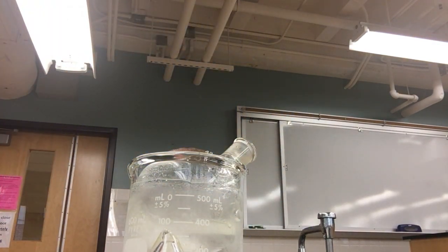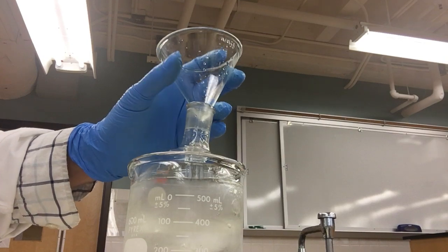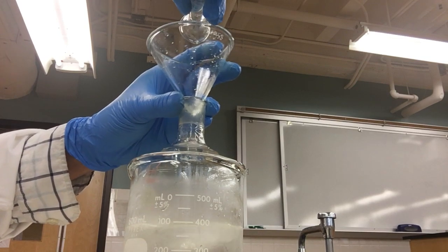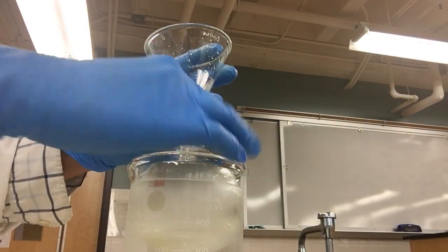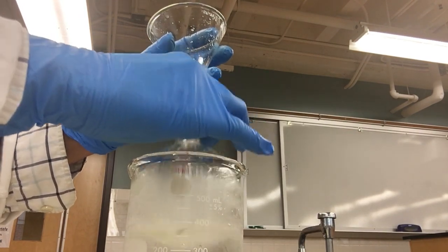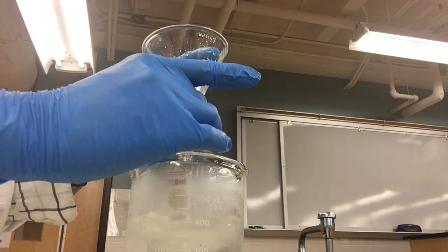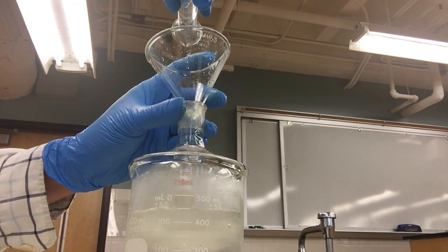Now for this step, as I was saying, there is a reason why all the quantities of the acid, the salt, sodium bromide, and our substrate, butanol are given in the exact amounts, and you have to come up with which is the limiting reactant. Is it going to be butanol, that's the limiting reactant? Is it sodium bromide or is it sulfuric acid? Find out the number of moles of each, and using that data find out who is the limiting reactant.